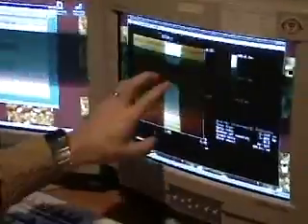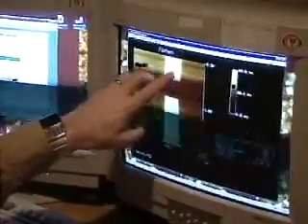If I draw boxes around these high places by clicking, letting go, then moving the mouse and clicking again, that's created a box, which probably you can't see very well on the camera. Let me draw another one over here that you can see nicely. I don't really want that one, so I'm going to clear both those boxes. So I'm going to draw boxes around the high places in the sample. So I've just drawn a box around this high place, and now I'm going to draw a box around this bottom high place. And now when I click on execute, the flatten algorithm is going to ignore those spots when it's calculating the flatten.